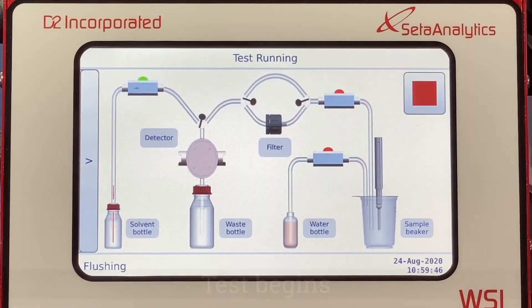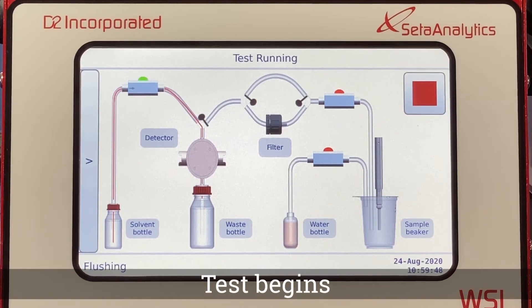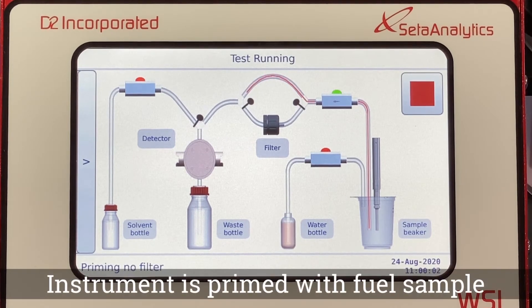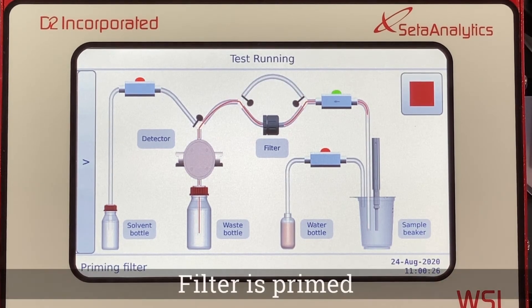Pressing next starts the test. The screen displays the test cycle. The detector is flushed with solvent. The instrument is then primed with the fuel sample. The filter is then primed.